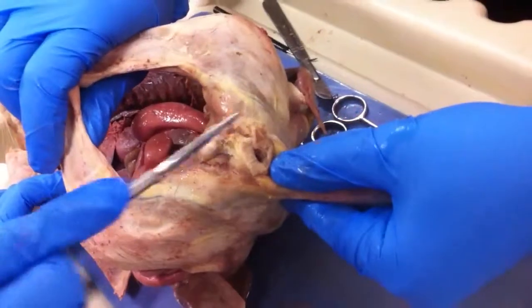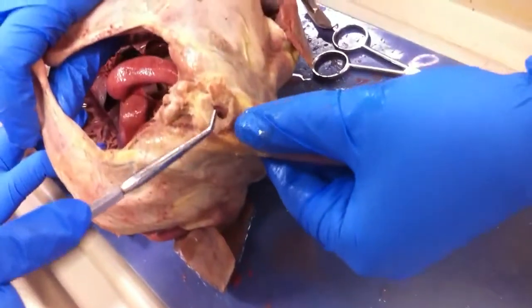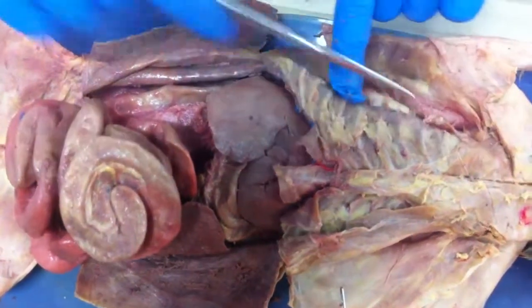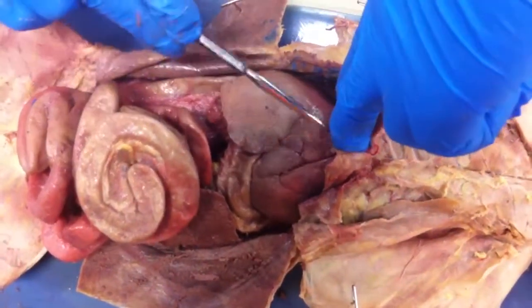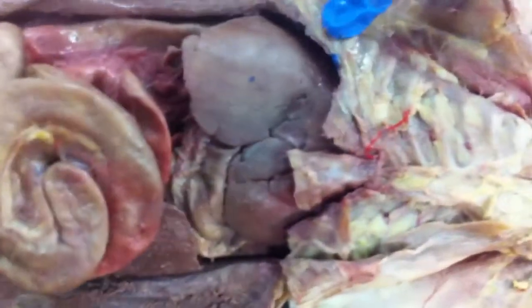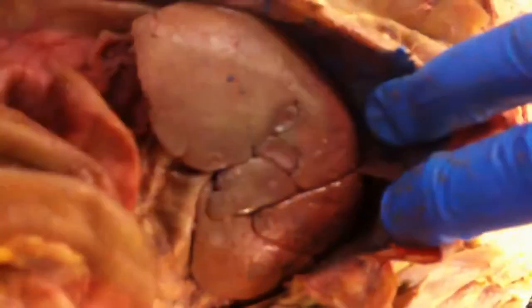This here is the cat's anus. Yeah, it's posteriorly located, right beneath the tail. This here is the liver, and these are the rib cage, and under the rib cage you have the diaphragm, and the lungs and various other organs. We gotta cut it open. It's back there, right in the back. Diaphragm.